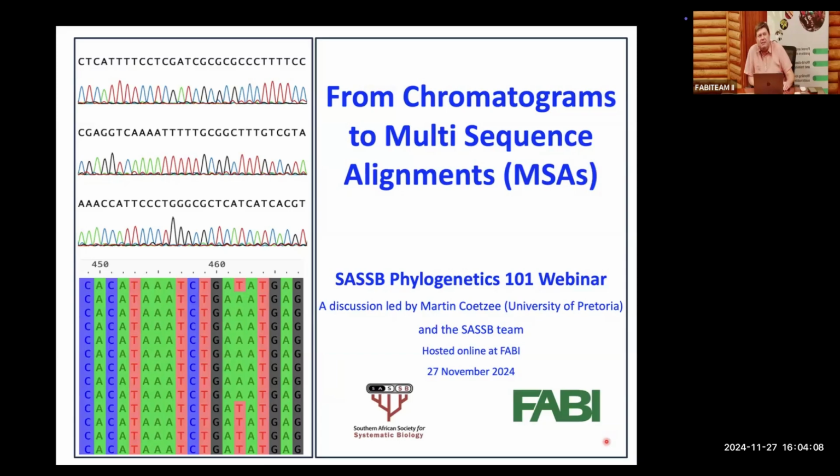I want to remind you that this is Phylogenetics 101. So we focus really on just basic principles, the basic understanding of some of the concepts, some of the ideas. How do we deal with data? What data should we use? How do we treat the data? So in that regard, I have decided to entitle this session From Chromatograms to Multi-Sequence Alignments. So we'll just touch on chromatograms very briefly, and then move to multi-sequence alignments.